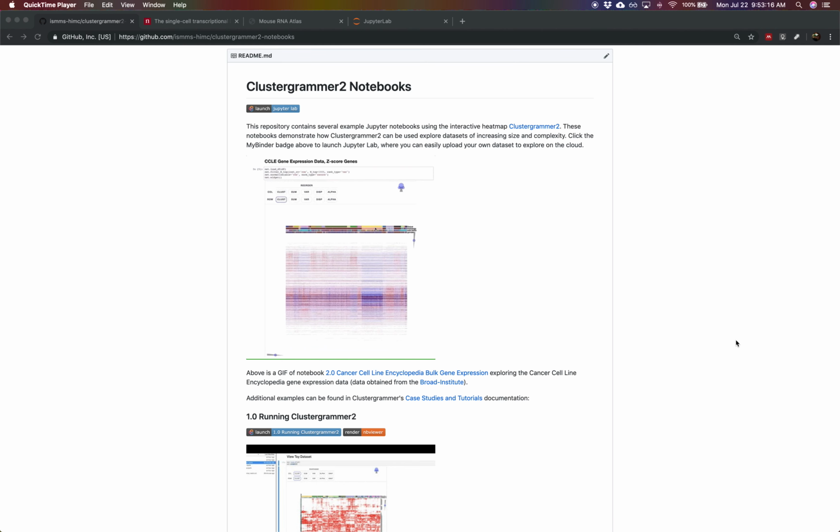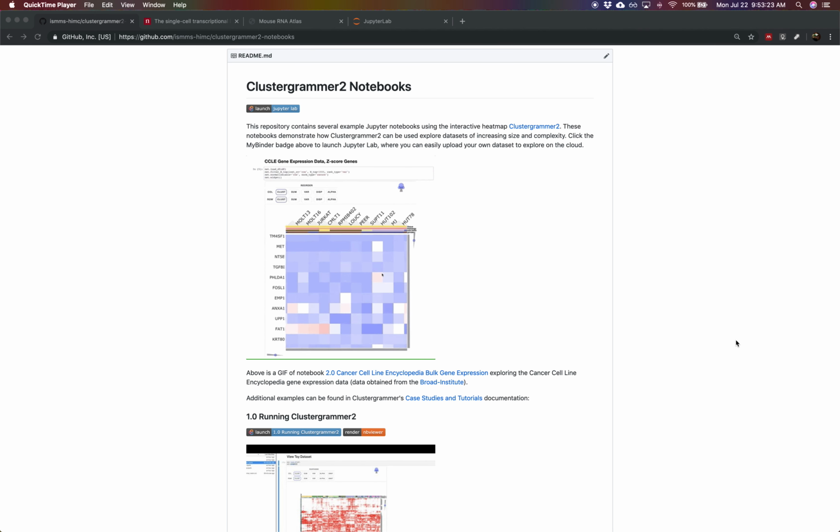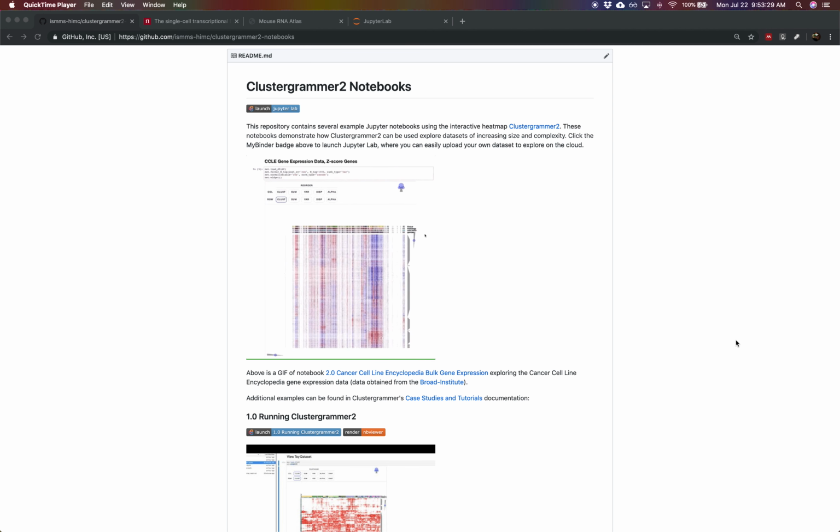Hello, I'm Nicholas Fernandez. I'm a computational scientist at the Human Immune Monitoring Center at Icahn School of Medicine at Mount Sinai. And this video is going to walk you through a short tutorial on how we can use Clustergrammer2 to explore a single-cell mouse organogenesis atlas, actually on the cloud using MyBinder.